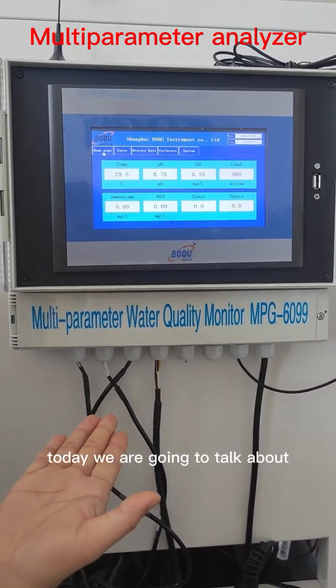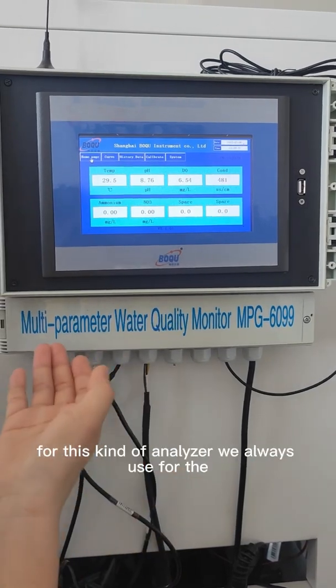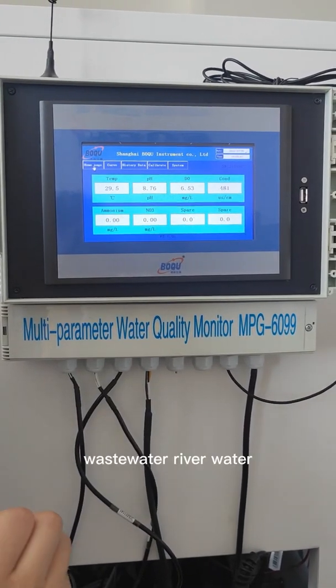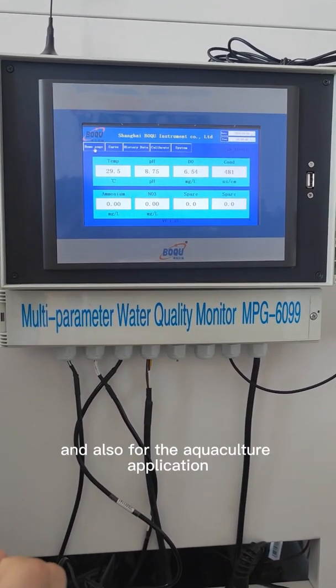Today we are going to talk about multi-parameter water quality analyzer. For this kind of analyzer we always use for wastewater, river water, and also for aquaculture applications.